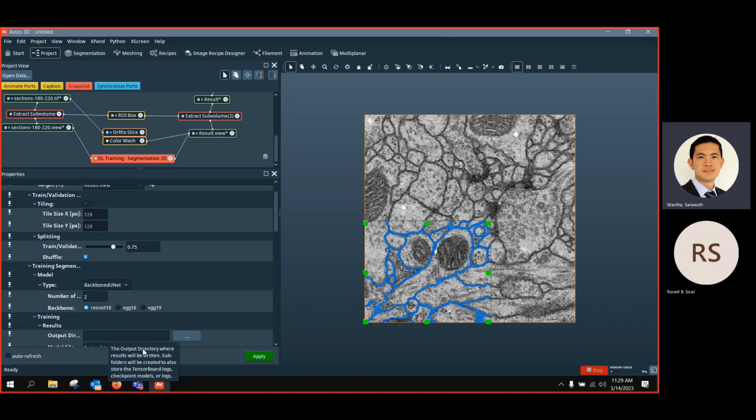So you have the option to break this image into tiles. For example, here you can set how many tiles to break from one image. So if you set 128, you can break this image into 4 pieces, and then instead of one image, you have 4 extra images, and this can increase the accuracy of training. But for this initial purpose, we don't do any tiling.